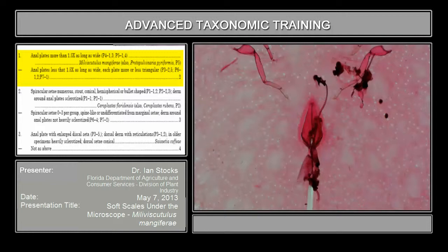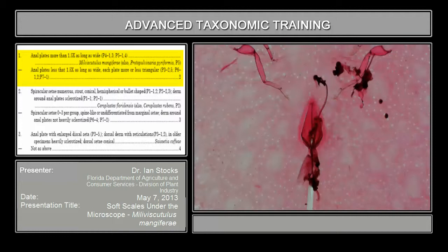You can also compare it to plate five, the first figure, and the fourth figure. The genus we're looking at is Milviscutulus mangifery — it's very common on mangoes. It's related to another genus, and actually used to be included in that genus, called Protopulvinaria. In Florida, we have the species Protopulvinaria piriformis, and the anal plates there are even more exaggerated — they're three or more times as long.